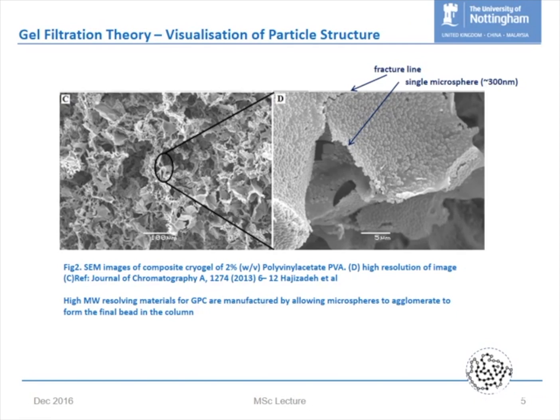One of the big problems with that is that each one of those little microbeads can be released from the surface. And because we're doing light scattering, on many occasions when we're working in the NCMH, that produces a background noise, which is a big problem. This really comes into play when you're working with big biomolecules, which in the polysaccharide fields that we work with, we are. If you've got smaller molecules, it's less of a problem because you're using slightly different technologies in order to create your microspheres, your particles.